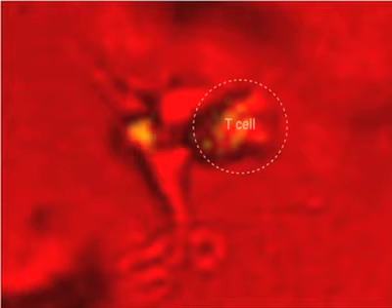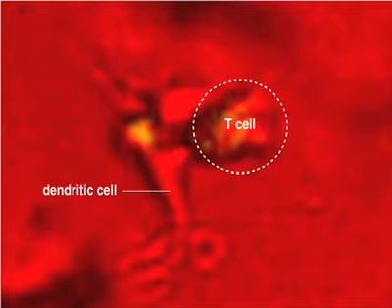In this video, we can see a T cell that becomes activated when it interacts with a dendritic cell. The T cell is labeled with a dye that fluoresces when it binds calcium ions. At the moment, the T cell is not activated. Its intracellular calcium concentrations are low, and so little green fluorescence is visible.